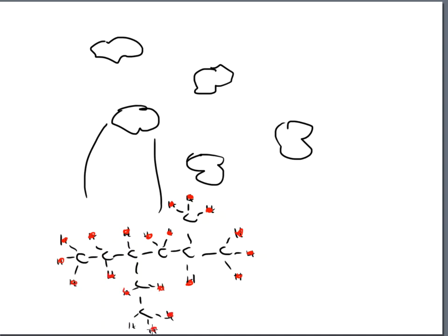That also means that these nuclei will spin, and they will spin maybe left to right. Some of them maybe could spin backward, right to left. Some of these could spin up and down. In other words, they can spin in whatever order they want to spin into. They can point in many different directions. We have no control of that, folks. That's just the way the molecule comes to us.